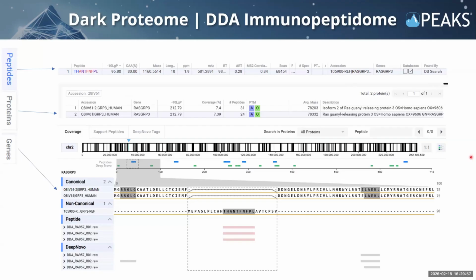The whole idea is that we also have this workflow designed to bridge the gap between proteomics and genomics, where we've integrated a comprehensive gene table. This gene table will map peptides to their genomic origins to visualize the origin of the peptides, directly linking them back to their corresponding gene. We're able to provide you gene site information, as well as the overlap between canonical and non-canonical peptides, and any de novo peptides where there was an amino acid tag will also be shown here.